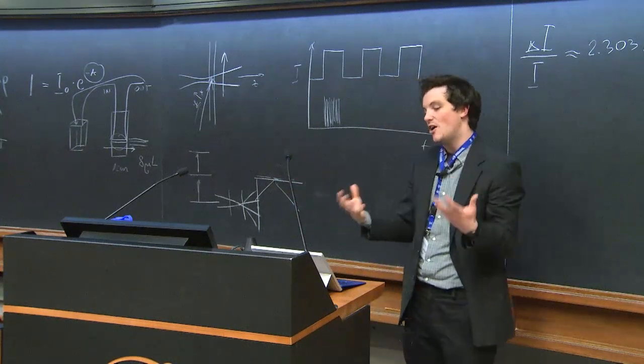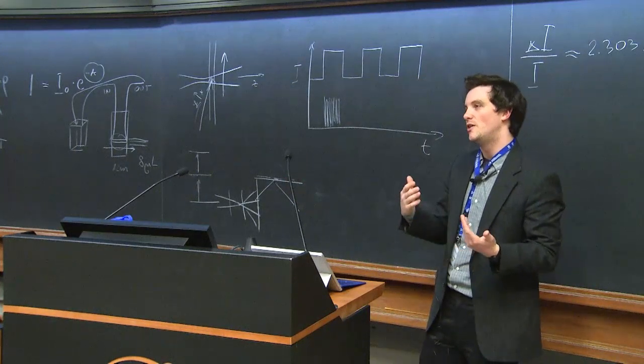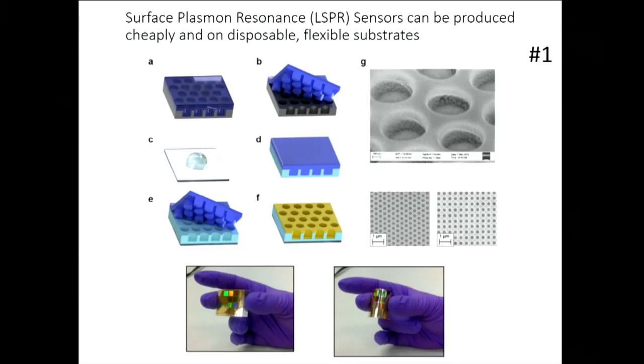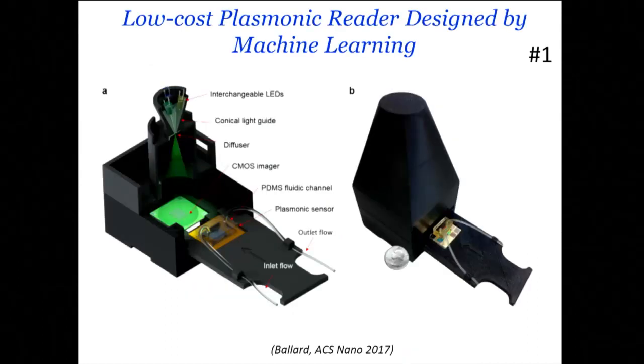Localized surface plasmon resonance sensors are also very cool because they're very cutting edge, but they're now becoming very cheap to produce. Using soft lithography techniques, which is basically a molding process with a UV glue or an optical glue, you can actually replicate nanostructures and then coat them with gold in an e-beam evaporator, which does need a clean room and an expensive piece of equipment, but it's an incredibly high throughput process, meaning that these sensors can be disposable. They can be flexible. The ones depicted in this image are printed on an overhead transparency. So we're looking at a future where maybe plasmonic sensors are embedded in existing medical technology or are printed on your books or things like this. Things of diagnostic value, or maybe even wearable sensors.